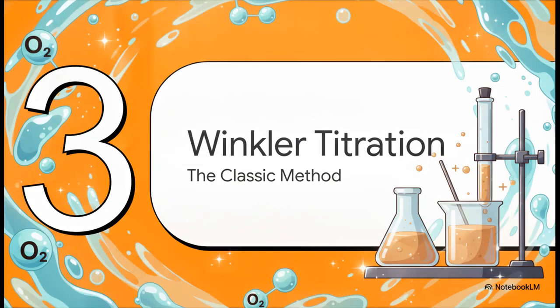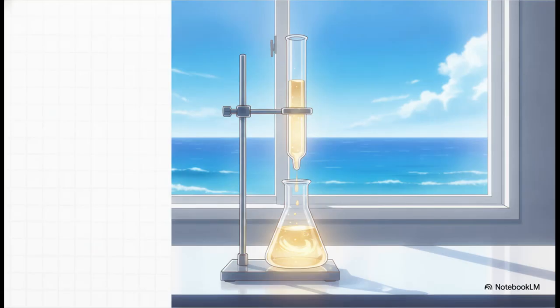So, we know what dissolved oxygen is, and we know why it fluctuates. But how do we actually measure an invisible gas trapped in the liquid? That brings us to Section 3, the classic Winkler titration. Let's transition from the what and why to the how, and look at the foundational chemistry of oxygen measurement. Way before the era of digital sensors, there was the Winkler titration.